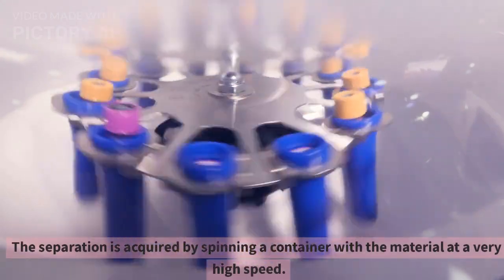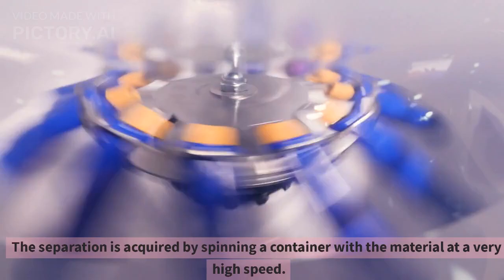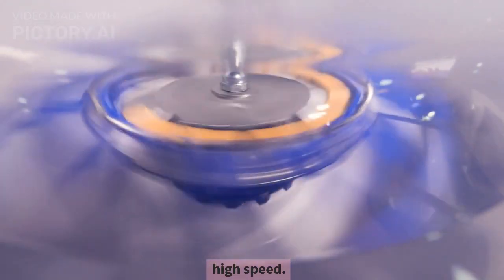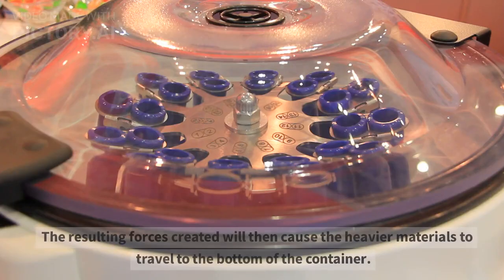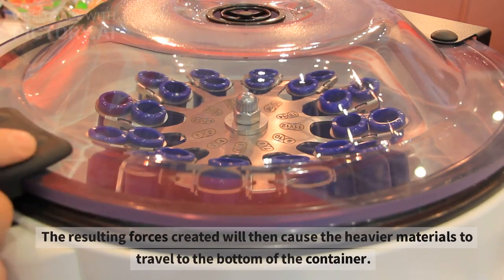The separation is acquired by spinning a container with the material at a very high speed. The resulting forces created will then cause the heavier materials to travel to the bottom of the container.